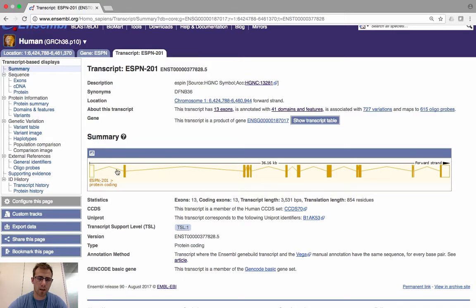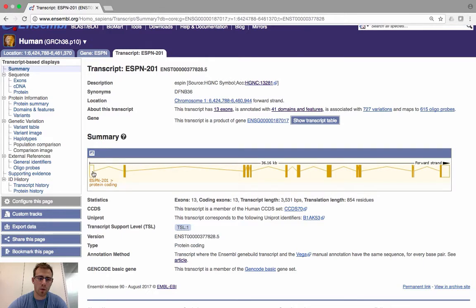In this summary page, you'll be presented with a graphical representation of the ESPN-201 transcript structure. You can see boxes connected with lines — the boxes represent exons and the lines represent introns. When the boxes are filled in, this represents a coding exon; when the boxes are empty, this represents a non-coding exon such as a five-prime UTR or three-prime UTR. The lines connecting the boxes are the introns — for example, this is one intron connecting two adjacent exons.